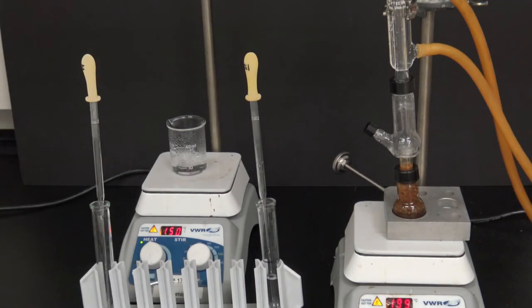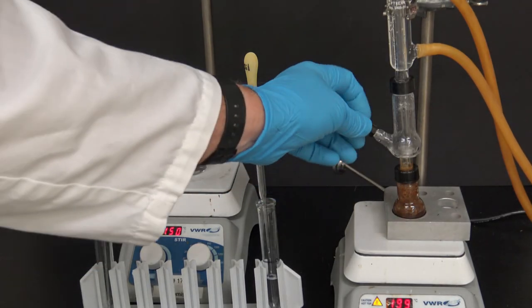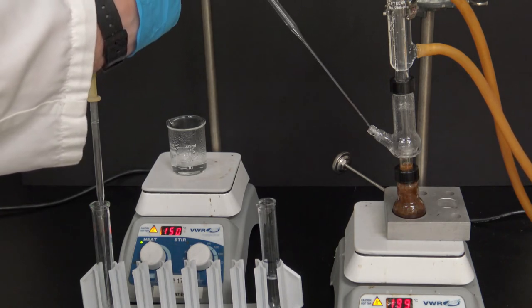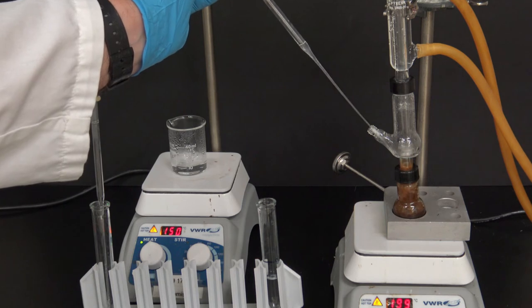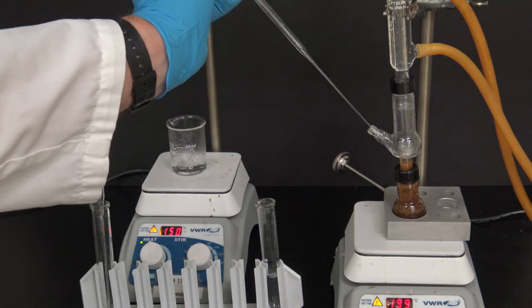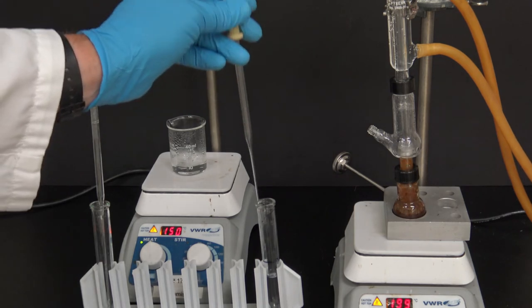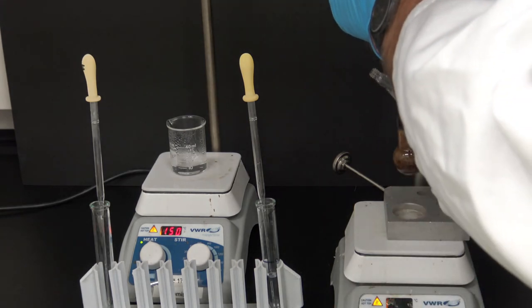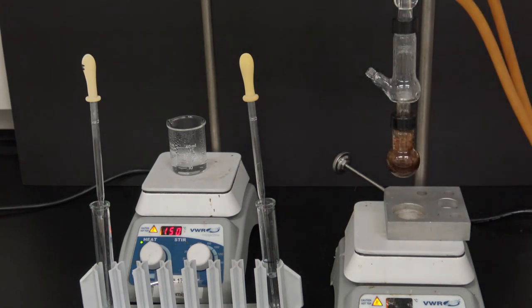Well, it's been about 4 hours now since we started distilling our clove mixture. Now, this is going to be my last sampling here. And that's going to get us up to just about 6 milliliters of liquid removed during the process. Now I'm going to turn off the heat and I'm going to raise the apparatus off to let it cool. And then we'll start processing the essential oils that we've collected in the next step.